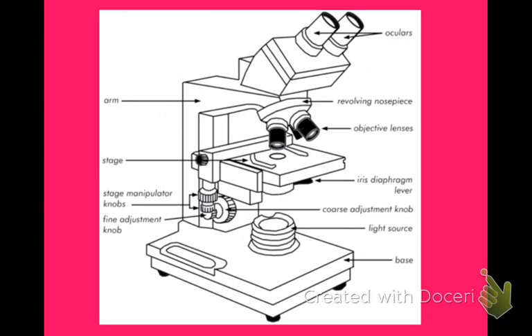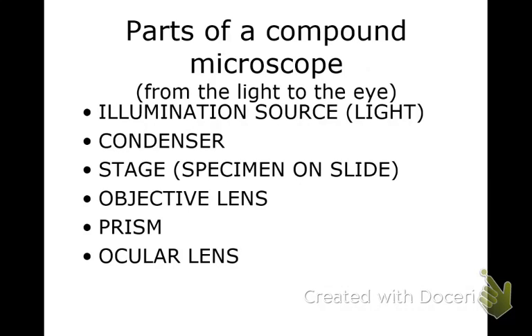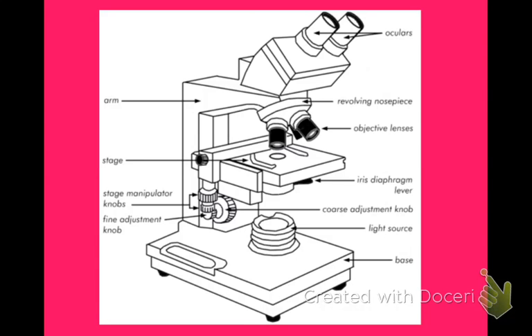And there's all the parts. We went over that in class. Okay, when you look at a microscope, this is just where the light goes from the light bulb, the illuminator, all the way to your eyes. So think about the microscope. I can probably do it from here. Okay, so it goes light source. So you look at your notes. Light source. And then it goes through the slide. It keeps going up. So it's going to go out this way.